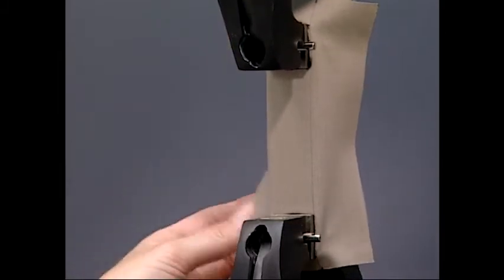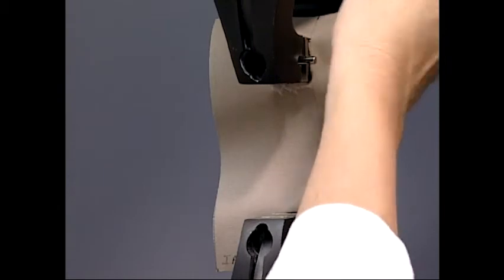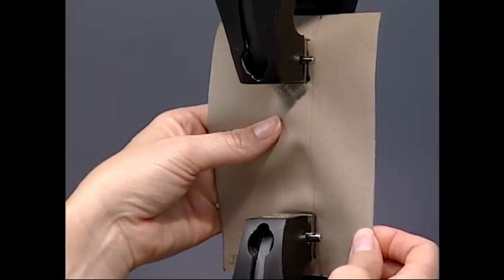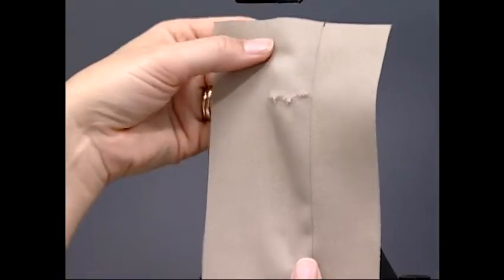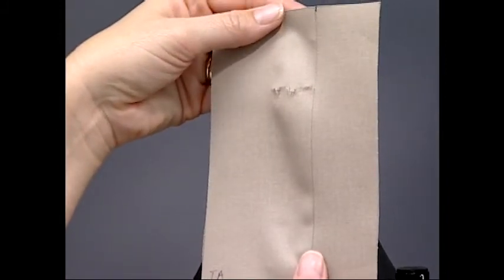Any specimen that breaks in an unusual manner, such as from jaw slippage or breaks at the jaws, should be discarded. For example, a jaw break is one that occurs within 0.25 inches of the clamps. If the test for a particular fabric direction has numerous or only jaw breaks, this should be properly noted, and if applicable, another form of strength testing might be used.